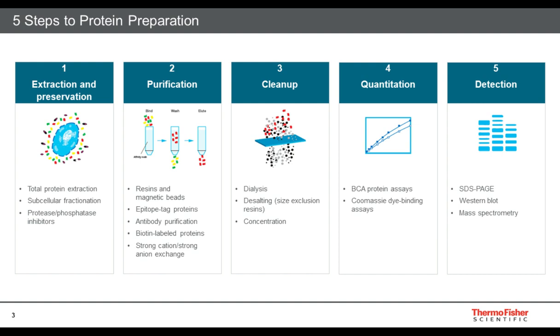So once you have your purified protein fraction, some sort of cleanup is beneficial. Both dialysis devices and desalting resins are frequently used to remove unwanted chromatography salts and small molecules that might have been used to competitively elute protein from affinity supports, as well as to exchange proteins into a buffer more suitable for long-term storage. Protein concentrators and diafiltration can also be used for this purpose, in addition to their more obvious function of concentrating proteins for more stable storage.